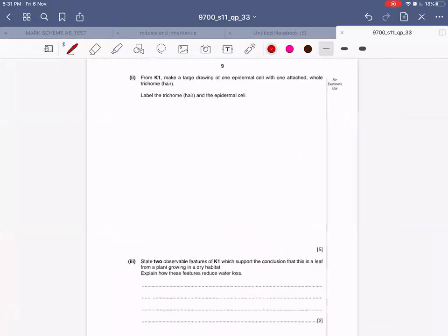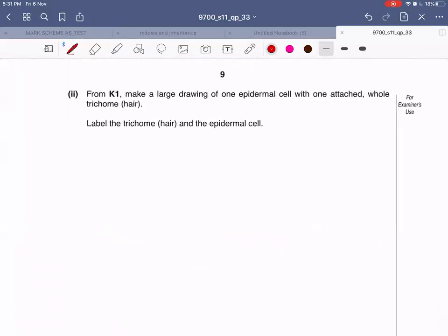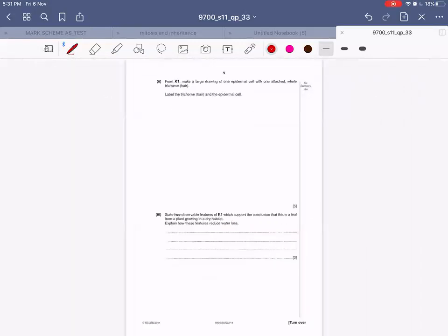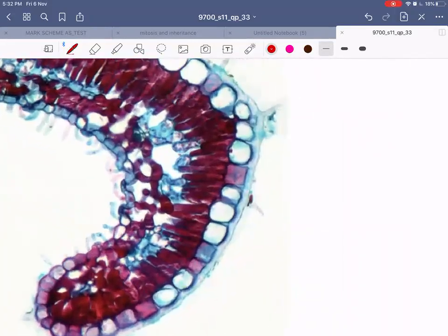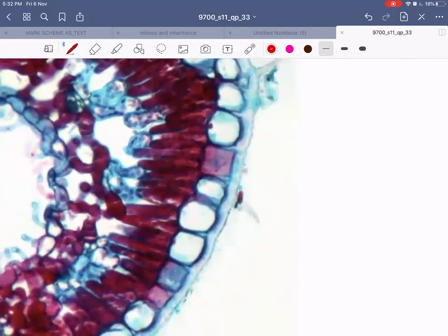Now let's move on to the next bit from K1 - the slide you've got. Make a large drawing of one epidermal cell with one attached whole trichome or hair, and label the trichome or hair and the epidermal cell. This is the trichome - it's a hair-like structure, and this hair-like structure has to be drawn as a high power drawing together with one epidermal cell attached.